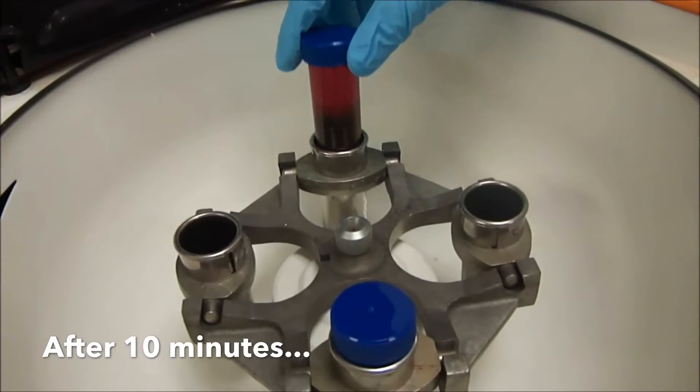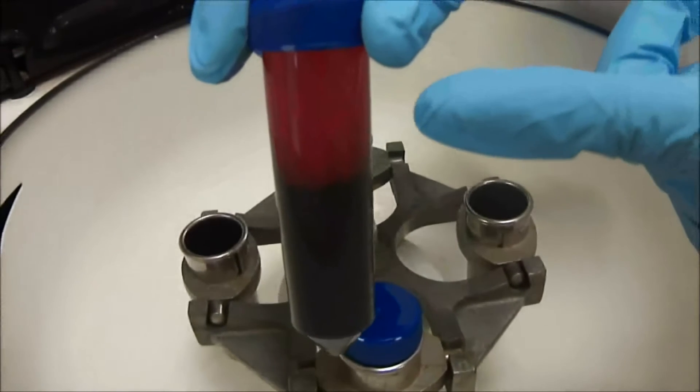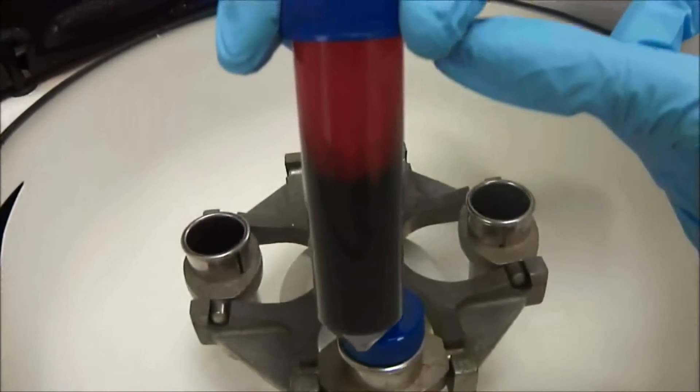After centrifugation, blood will separate into two layers. A clear supernatant forms at the top, which separates from the heavier erythrocytes.